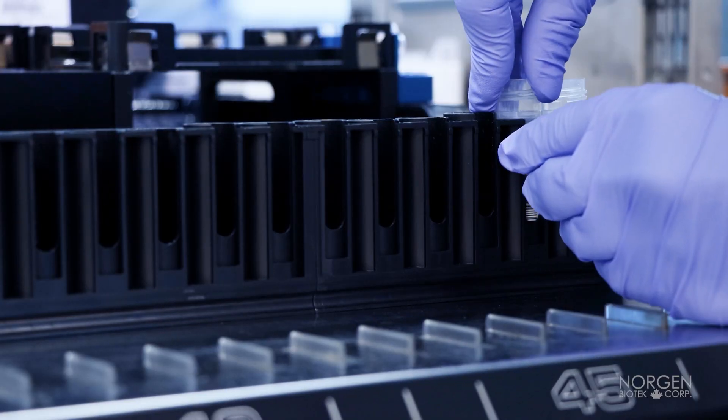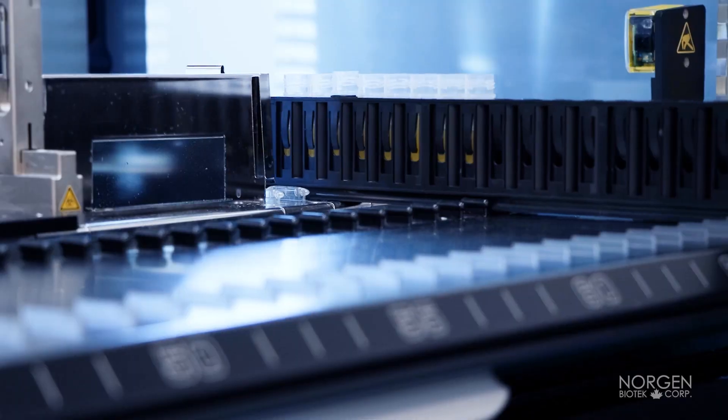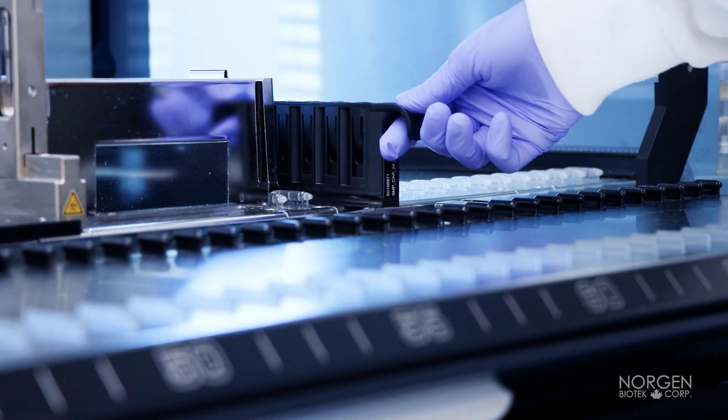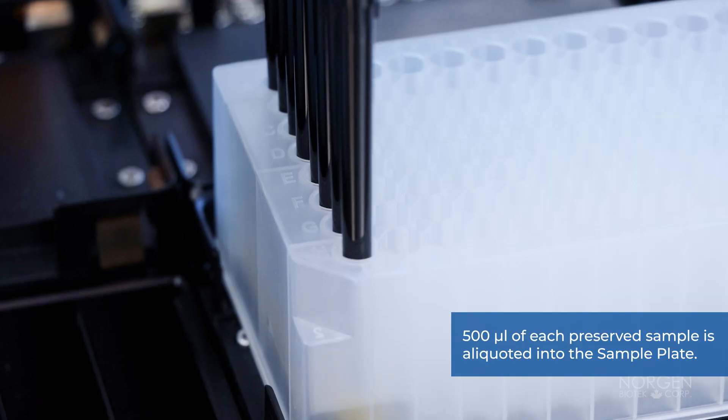Load the samples onto the Hamilton Vantage in the location indicated on the deck setup for samples. 500 microliters of each preserved sample is aliquoted into the sample plate.